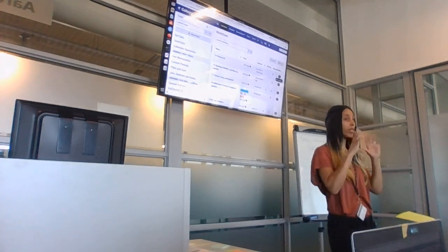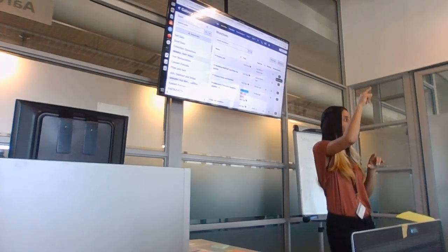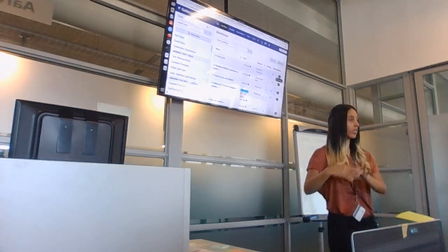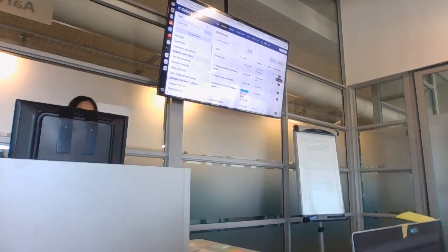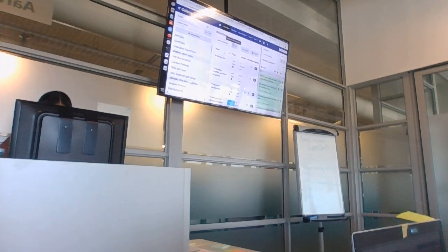So you would have to create a new history, put all of your samples in there, and then go to the workflows button and click run workflow so that it can run it on the new data that you put in there. So in our case, we don't want to do that, but we did notice that we didn't have Kraken. So we're going to, if you look at view, click on edit, sorry.